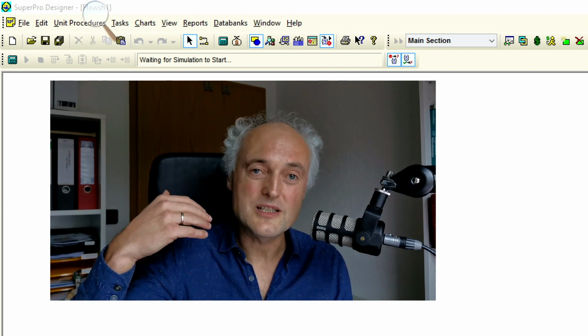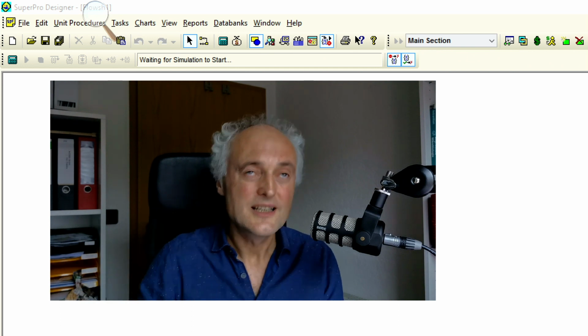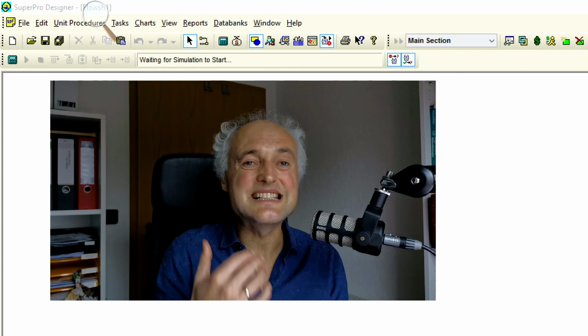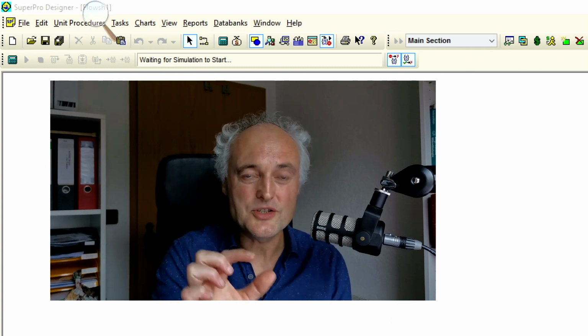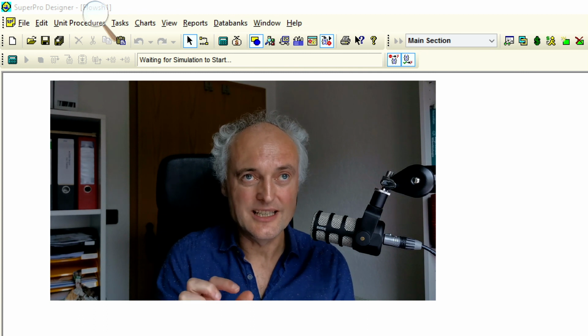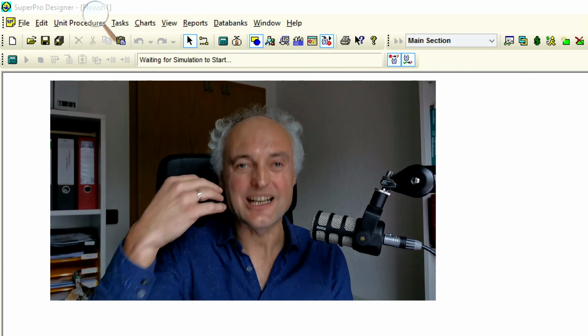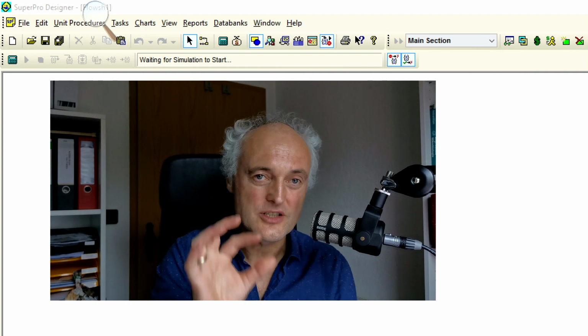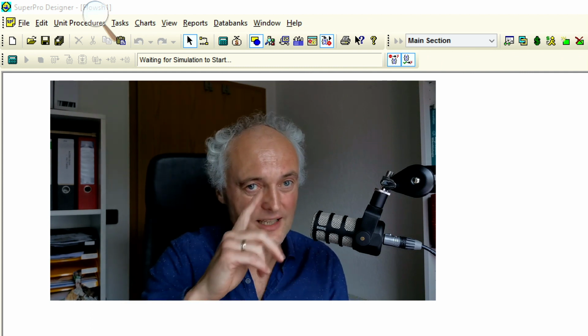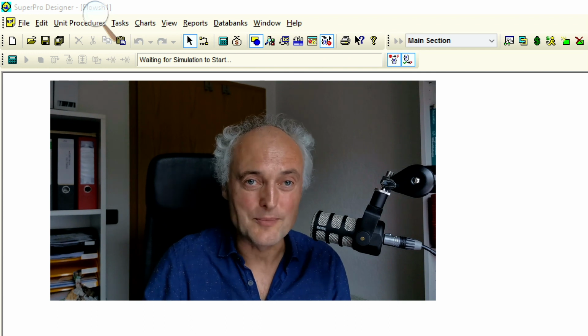For your process later on, maybe keep things simple. Only initialize things you know you need at the beginning. Don't initialize everything you can think of. Initialize just what you need. We will talk about how these substances are dealt with internally in the next example.